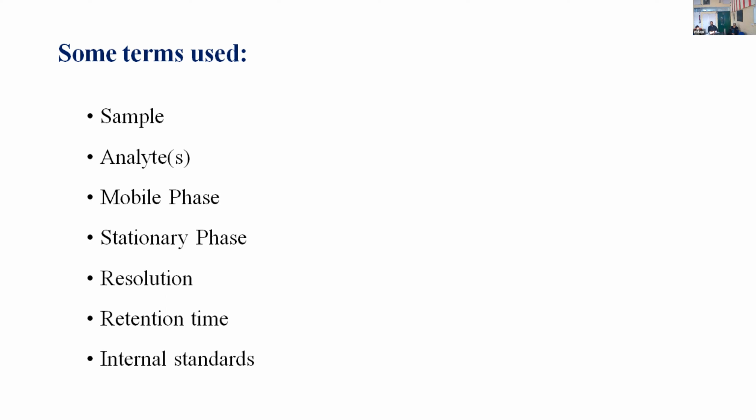Sample means any mixture or any compound which is injected in the HPLC for the identification and quantification of the compound in which we are interested. It may be a mixture, or it may be a single compound. It may be a biological sample. It may be a pharmaceutical compound or pharmaceutical formulation. It may be anything.